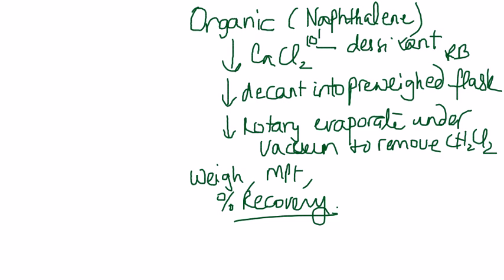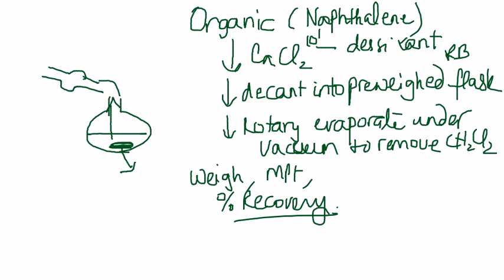You will rotary evaporate. That means that the lab tech is actually going to work on that part with you. So you will have to provide your sample and stand in a queue, get your solvent removed from the system. Now what remains behind in your round bottom flask, as you remove the solvent, is the solid, after you have subjected that to rotary evaporation.